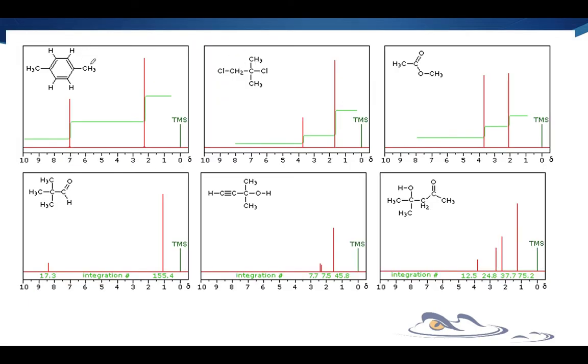So here's some molecules. We already did this one, but this one's good because I want to show you a different way that they're integrating it here, okay? So the integration is right here. See that? That is the integration right there. And so the height from this line up to this line, the height right here, that is what gets measured.